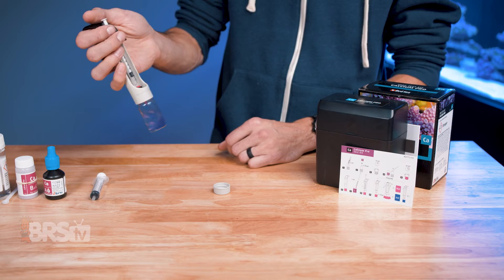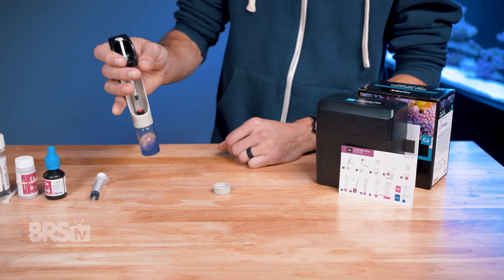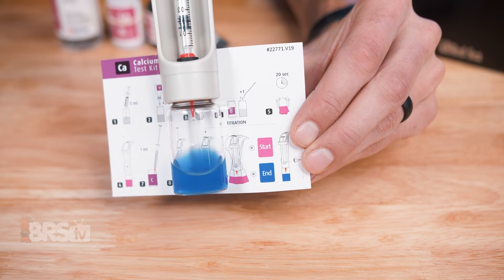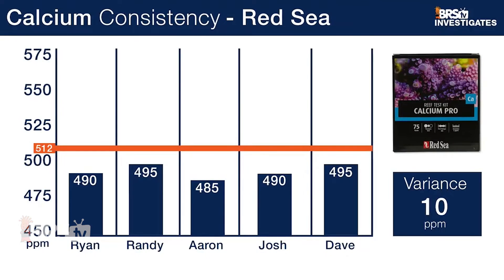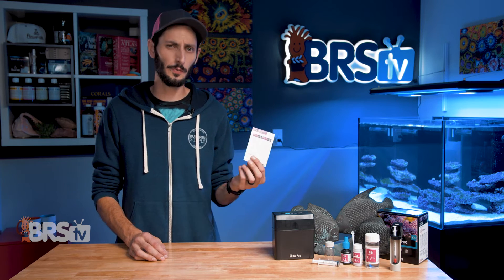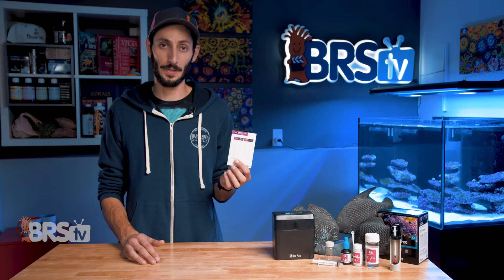The endpoint color on this test is also very apparent, which is super important since it tells you when the test is complete. The change being stark and obvious is another big reason why you can hand this test kit to any five hobbyists, regardless of their experience level, have them test the same aquarium water, and get consistent test results across the board. Once you hit the endpoint, you compare the amount of titration solution you've used to the chart and you've got your reading.